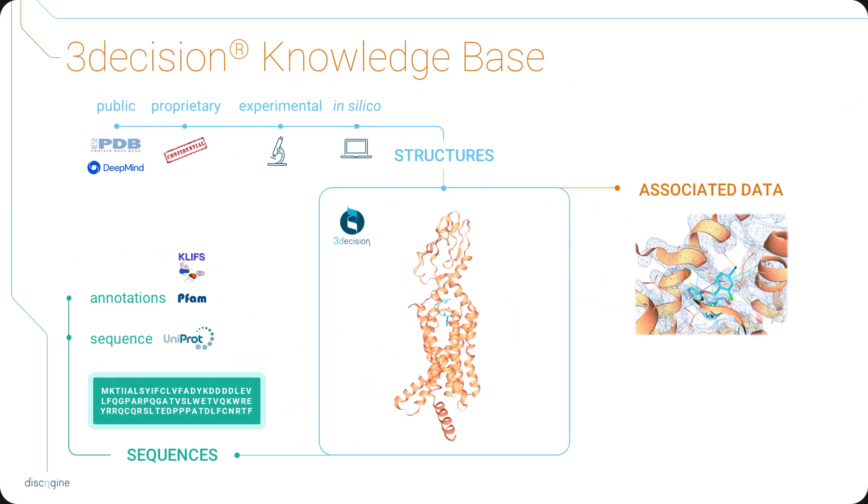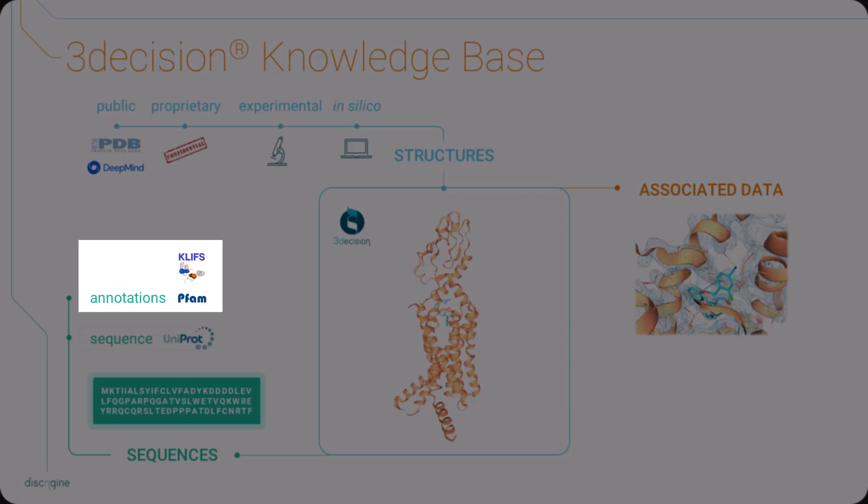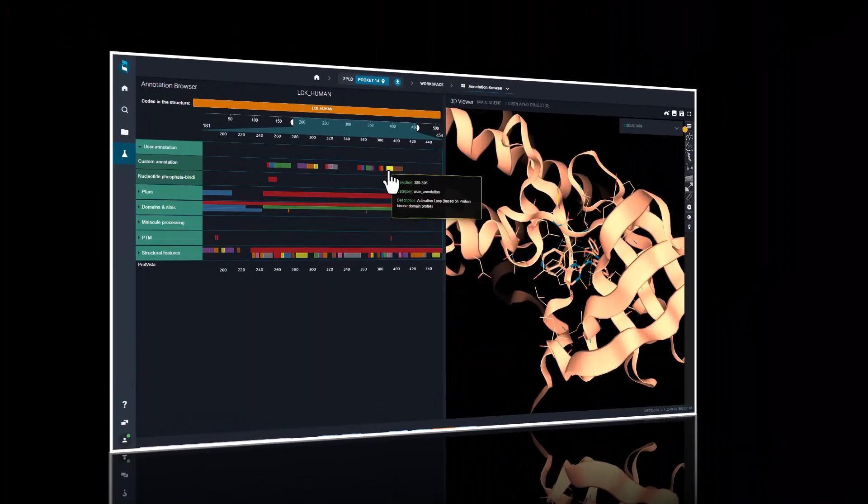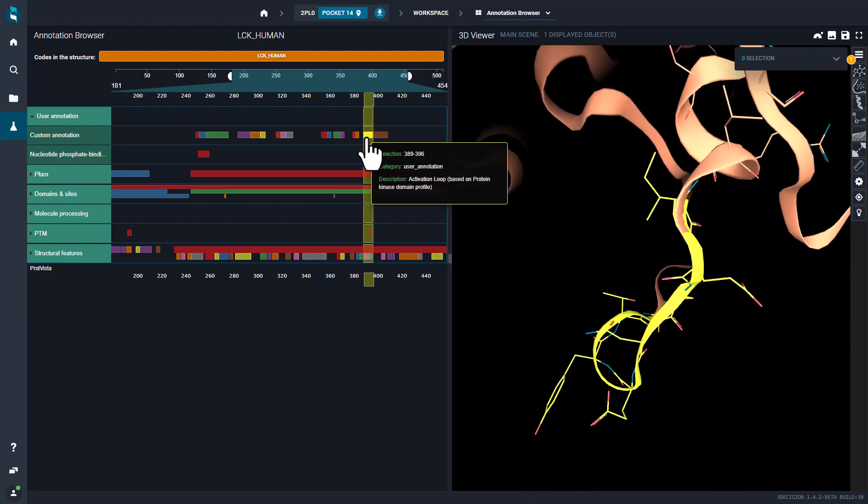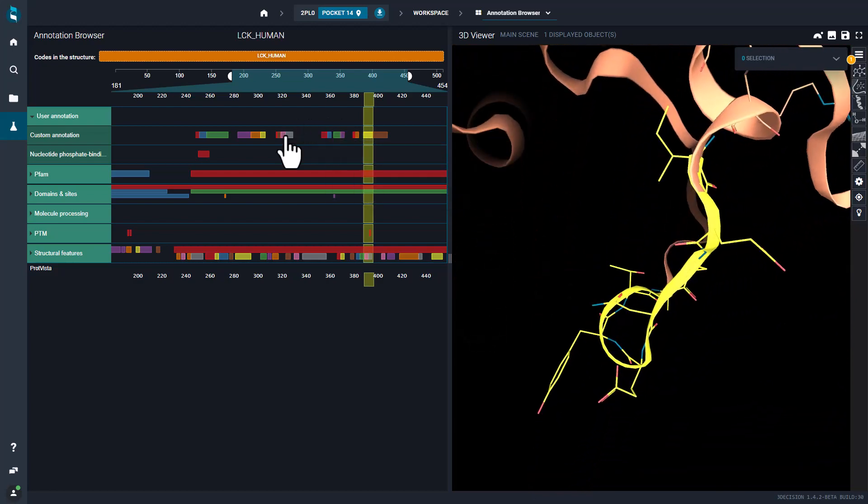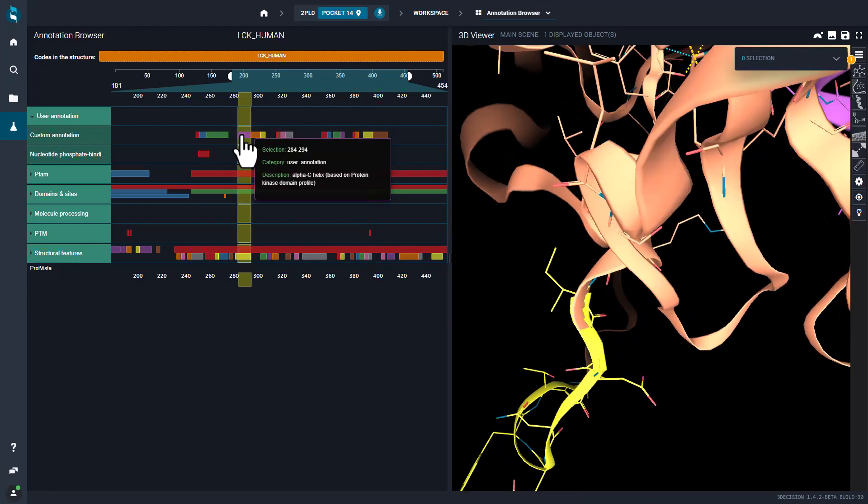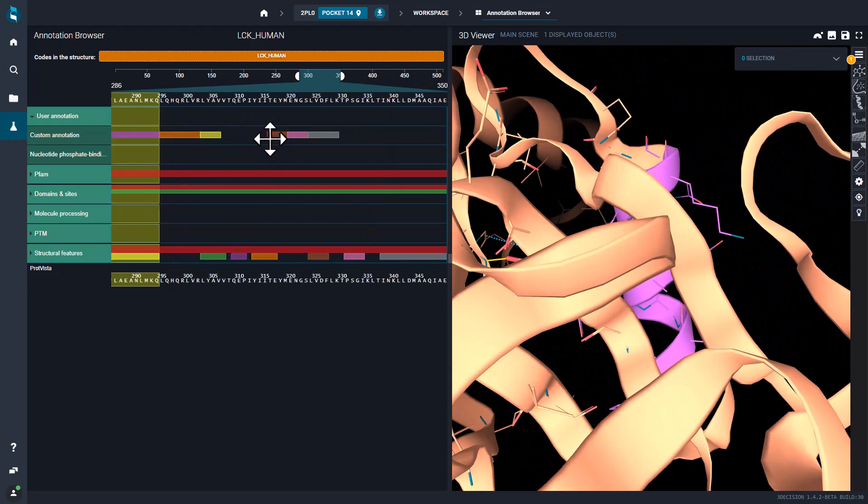All the structures registered in 3Decision are mapped back to their uniprot sequence, along with structural and sequence annotations. These annotations can be visualized in the 3D structure, to facilitate the inspection and navigation through different protein domains or specific residues.